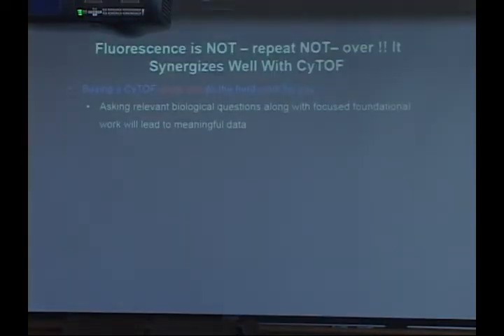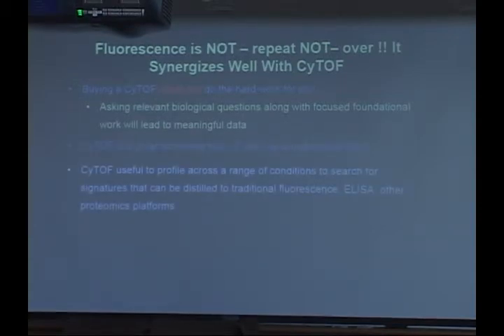So to tie up: fluorescence, we like to say, is definitely not over. It's incredibly important. It plays a role in these experiments, and it synergizes with CyTOF. Just because you have one or know someone who has one doesn't mean that you don't do any more hard work. As I have stressed, asking relevant biological questions along with focused foundational work will lead to meaningful data. CyTOF is a great screening tool.